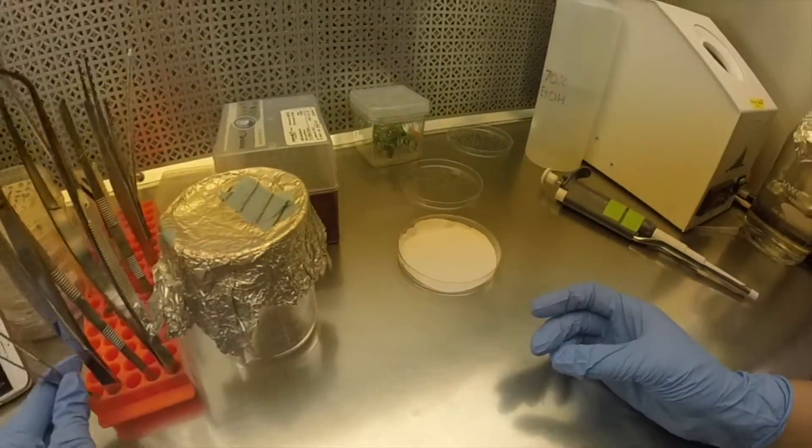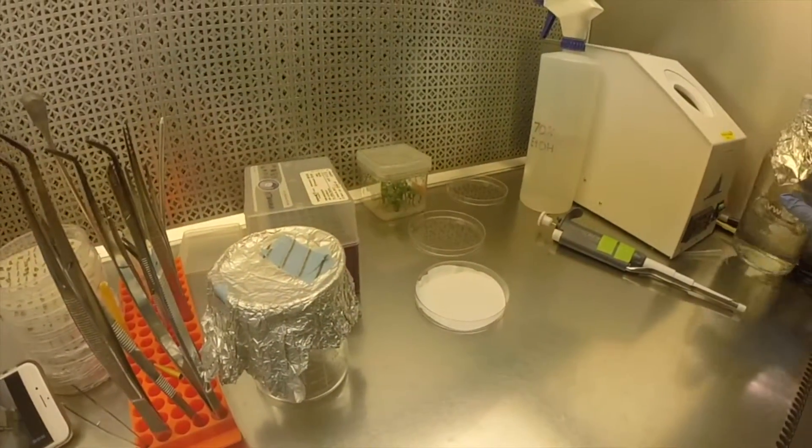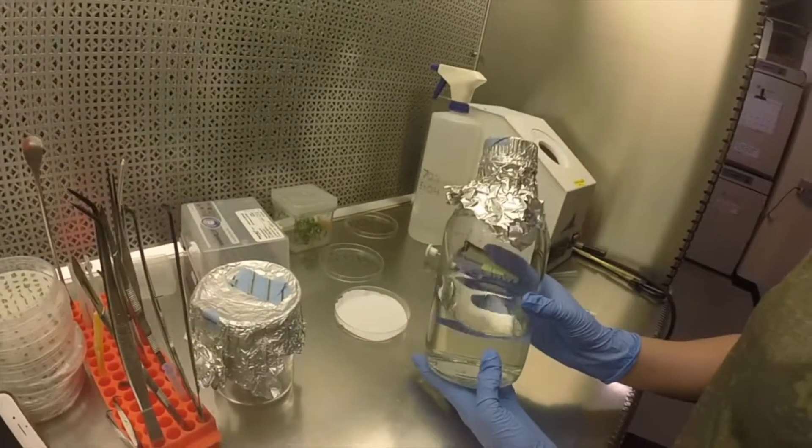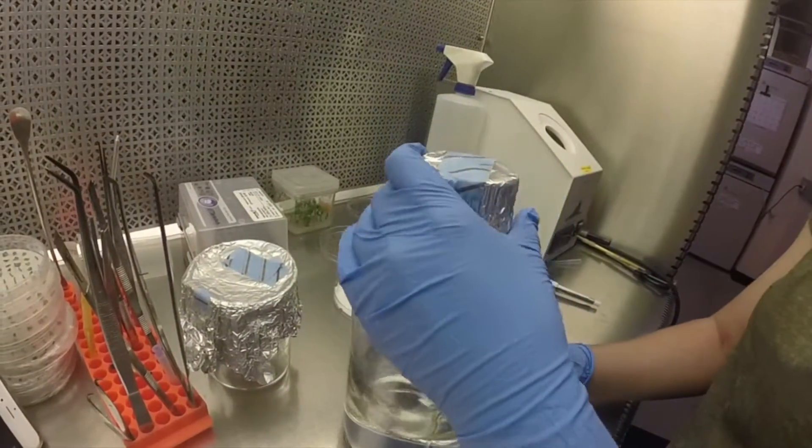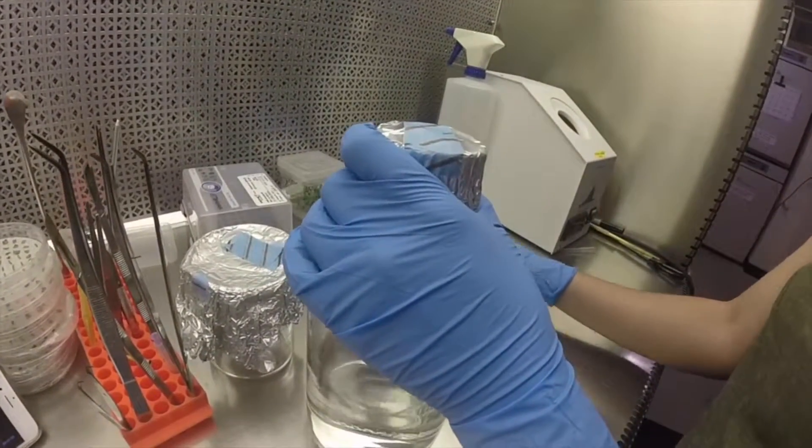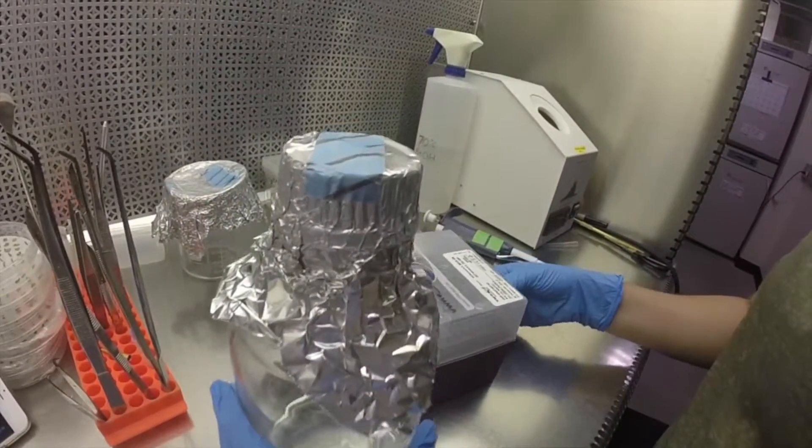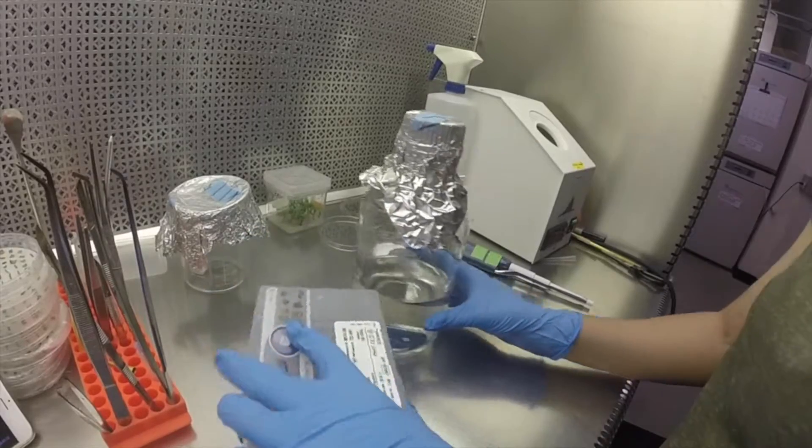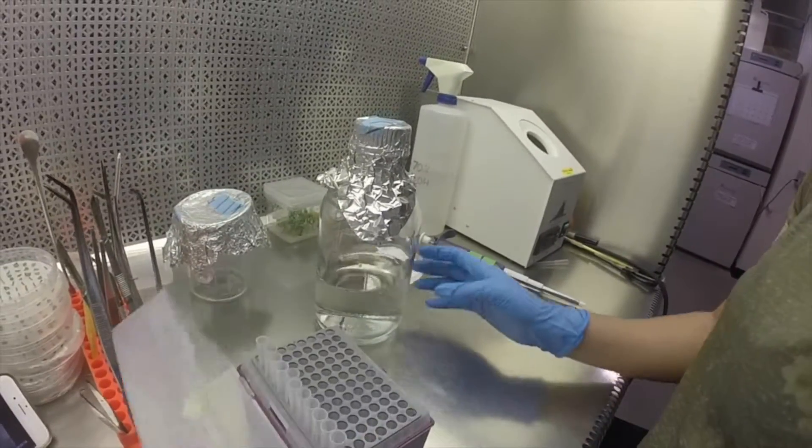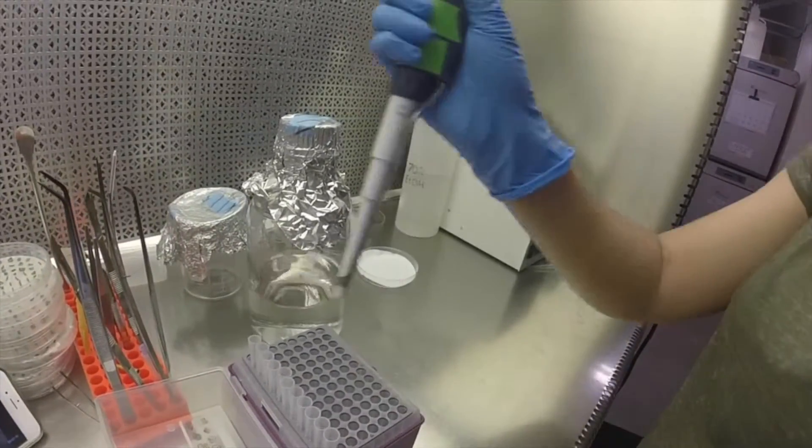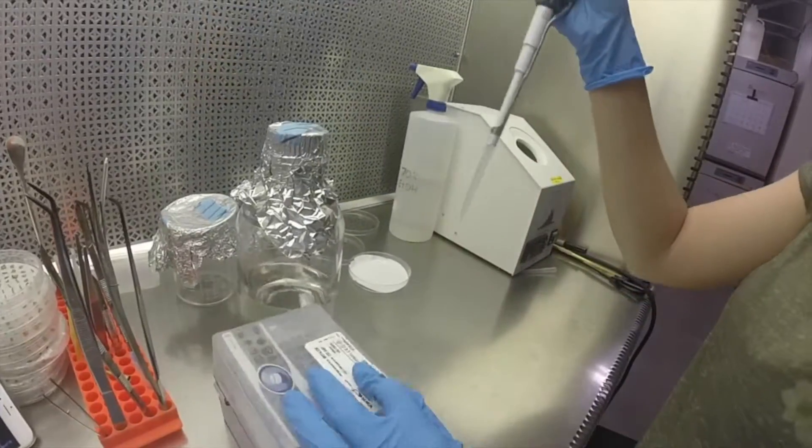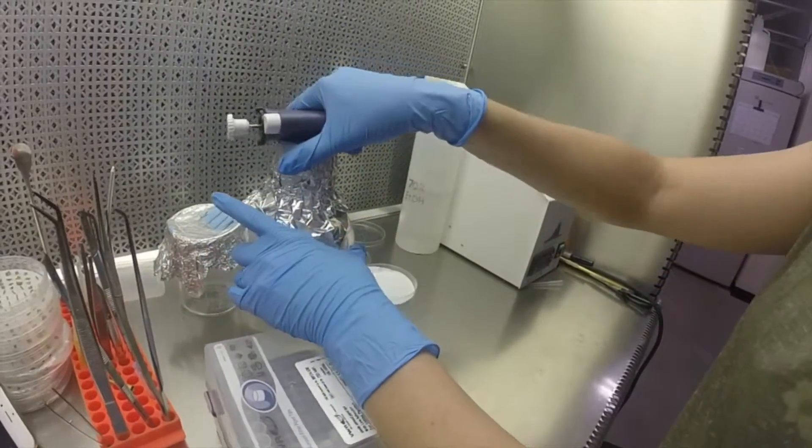Once we have our filter paper in place, we're going to take some sterile MS medium liquid medium that we have already prepared. We're going to pipette two milliliters of media onto the filter paper. All of this stuff will be sterilized ahead of time.